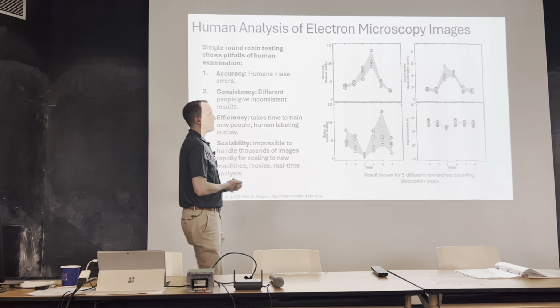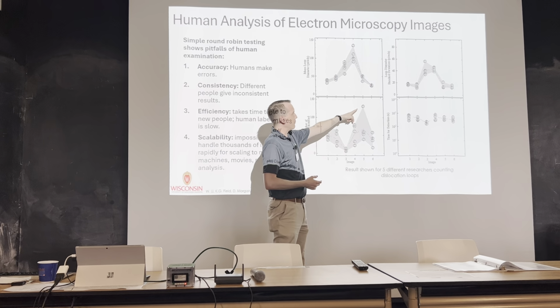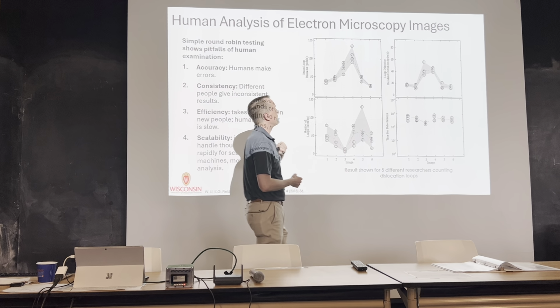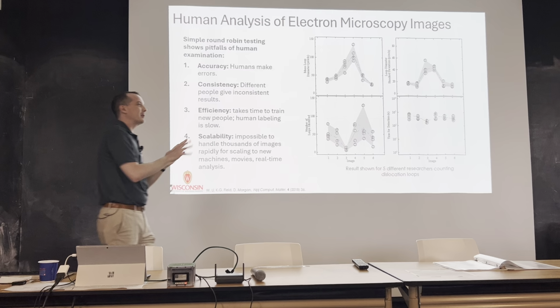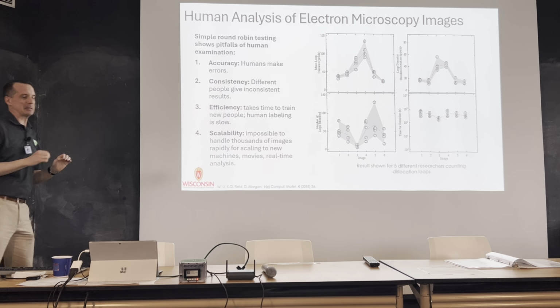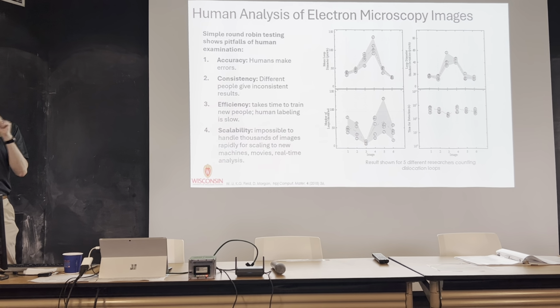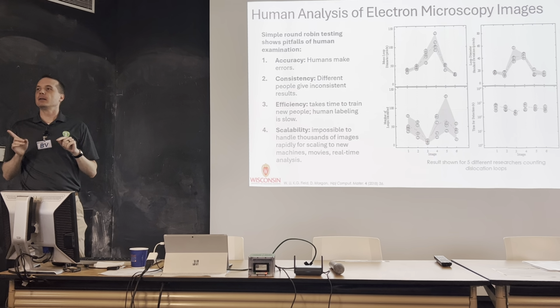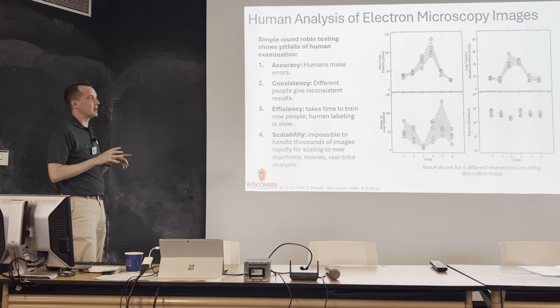And we can see that there's actually some bias. We think that this person ran out of coffee or something, or there's also some inherent variability in the system, because you get two microscopists in the same room, they're never going to agree about what's a black dot or not. Right? Everyone's going to have their own opinion about what it is.